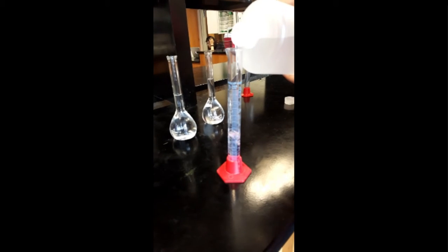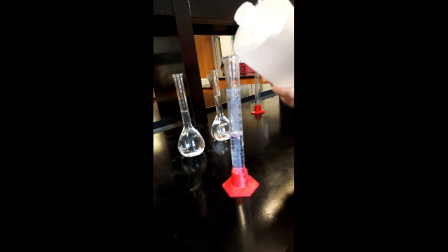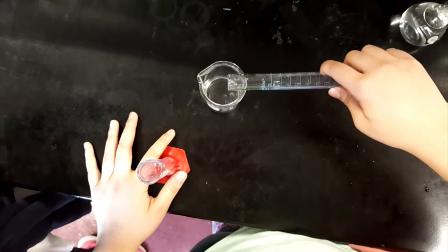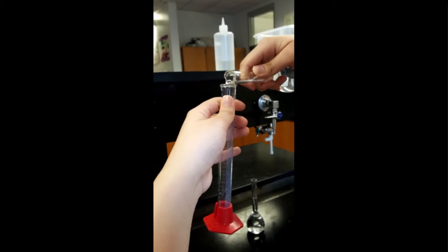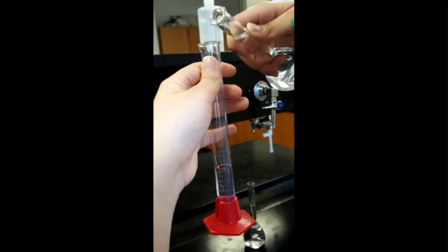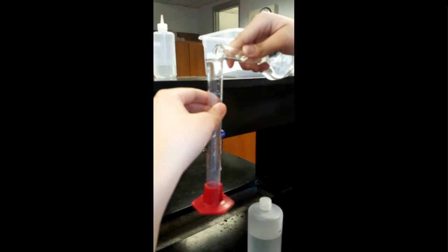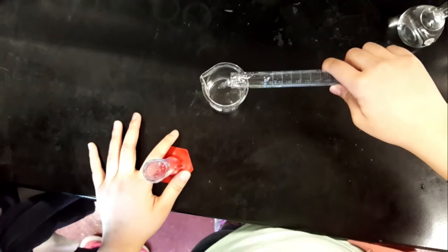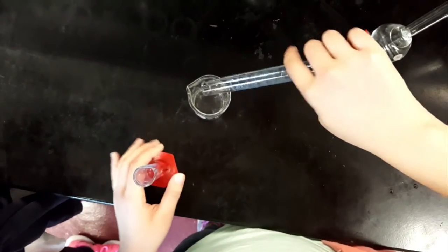Using the data table from the pre-lab as a guideline, fill each beaker with different amounts of distilled water using one of the graduated cylinders. Since the total volume of each beaker must be 40 milliliters, subtract the volume of water from 40 to define the volumes of the 0.2 molar potassium iodide and the 0.1 molar lead nitrate. The two volumes must be the same.